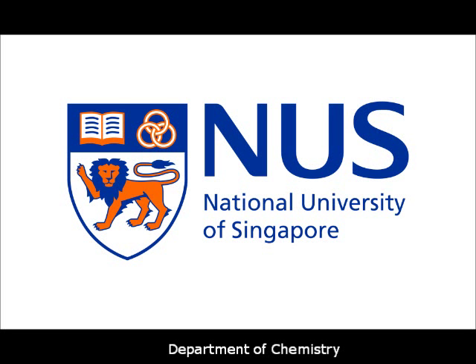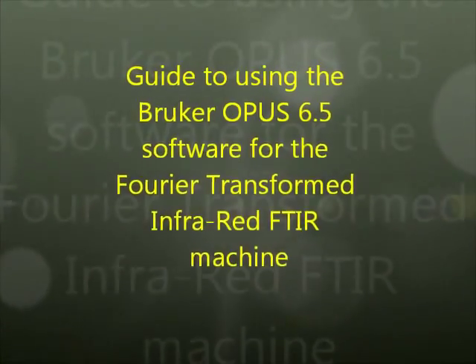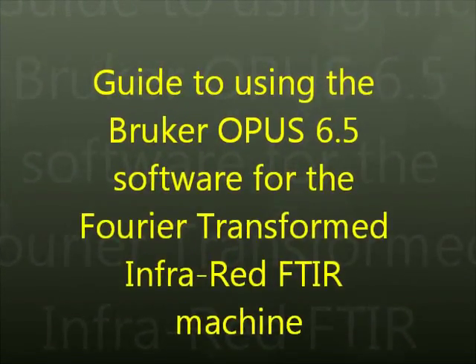Hi folks, you'll be watching this video to guide you on how to use the Bruker OPUS 6.5 software for the Fourier transform infrared FTIR machine.